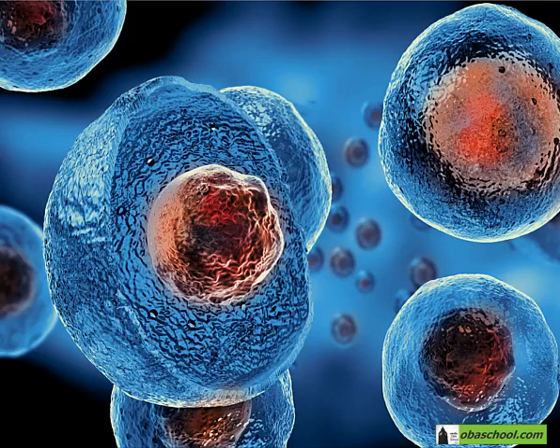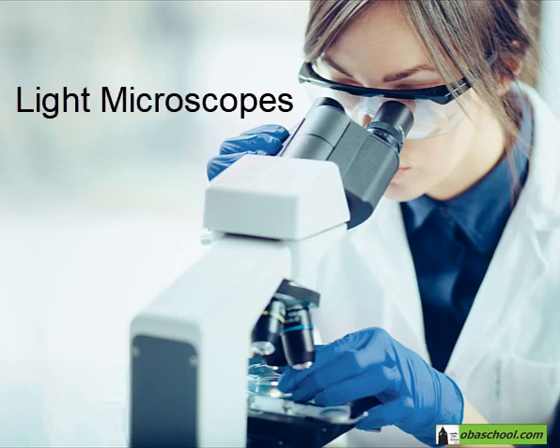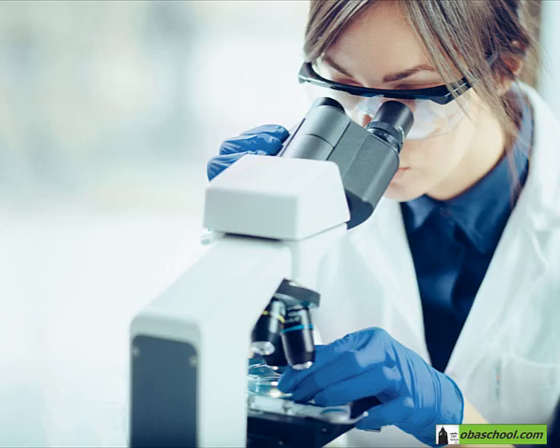The world of the microscope. Living things are all made up of cells, but most cells are so small you can only see them using a microscope. The first light microscopes were developed in the mid-17th century. Their development has continued ever since, and they are still widely used to look at cells.